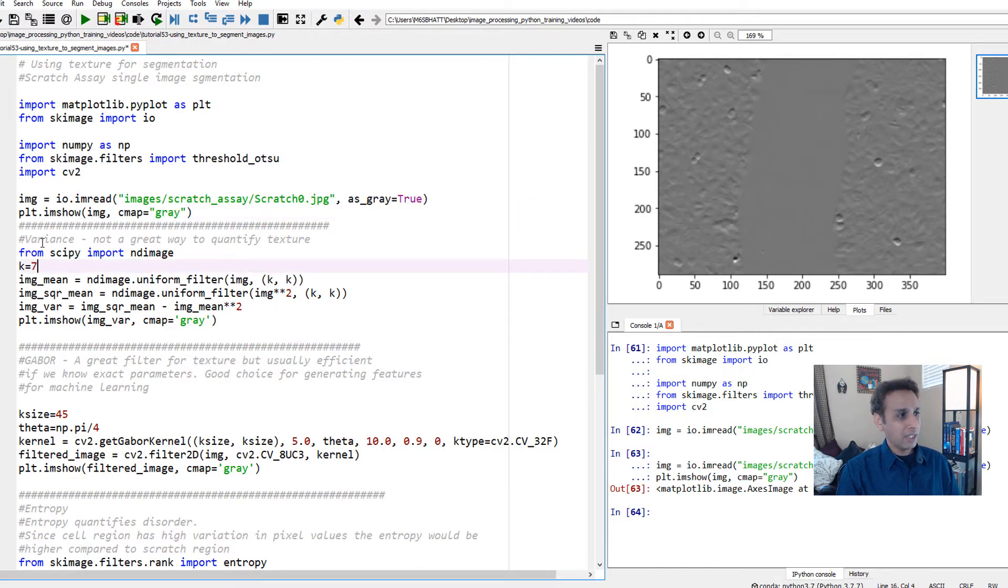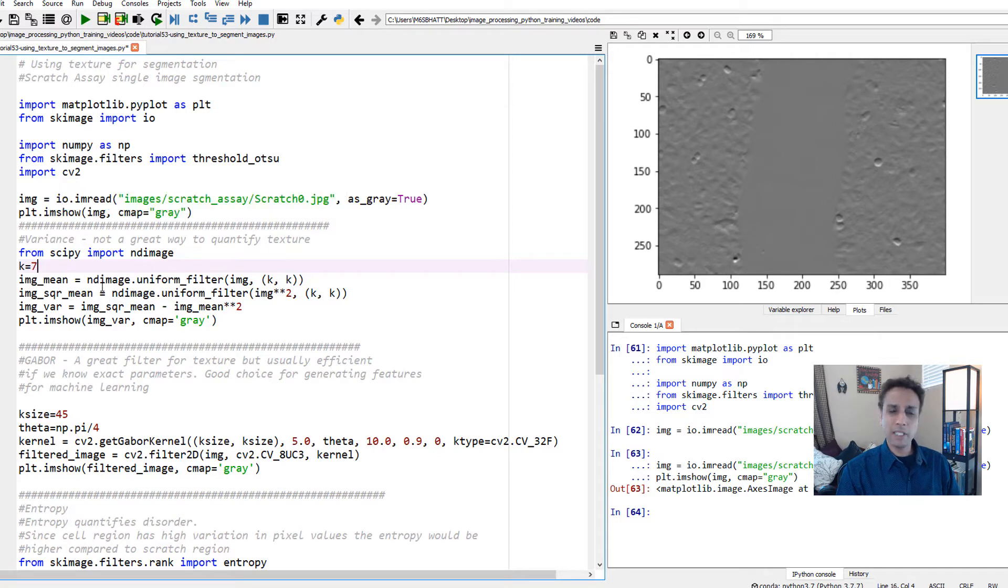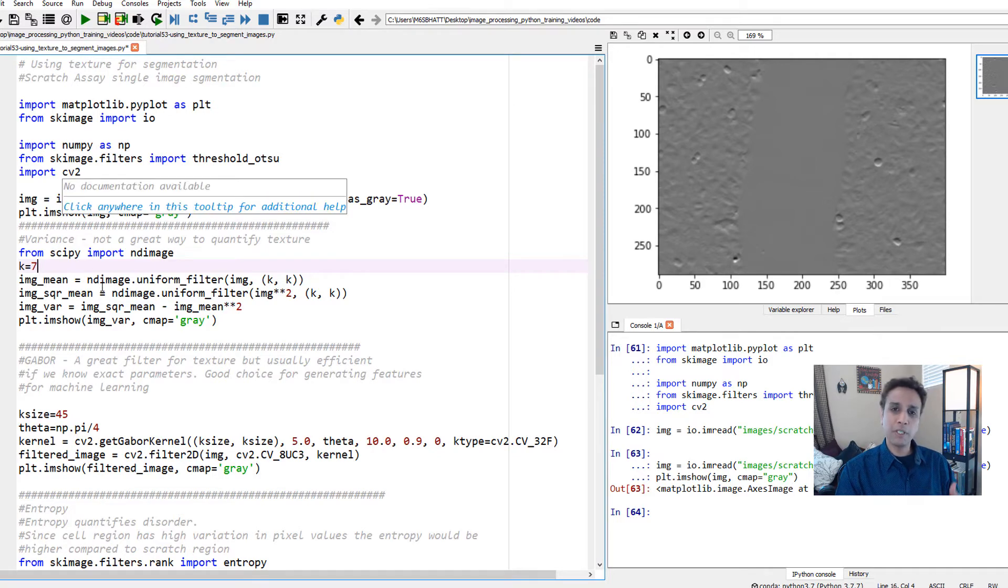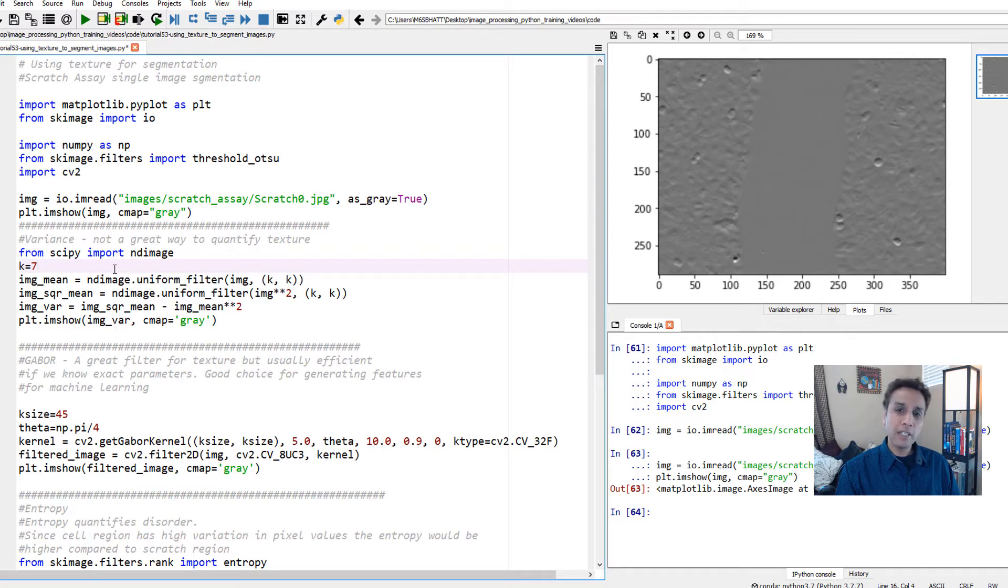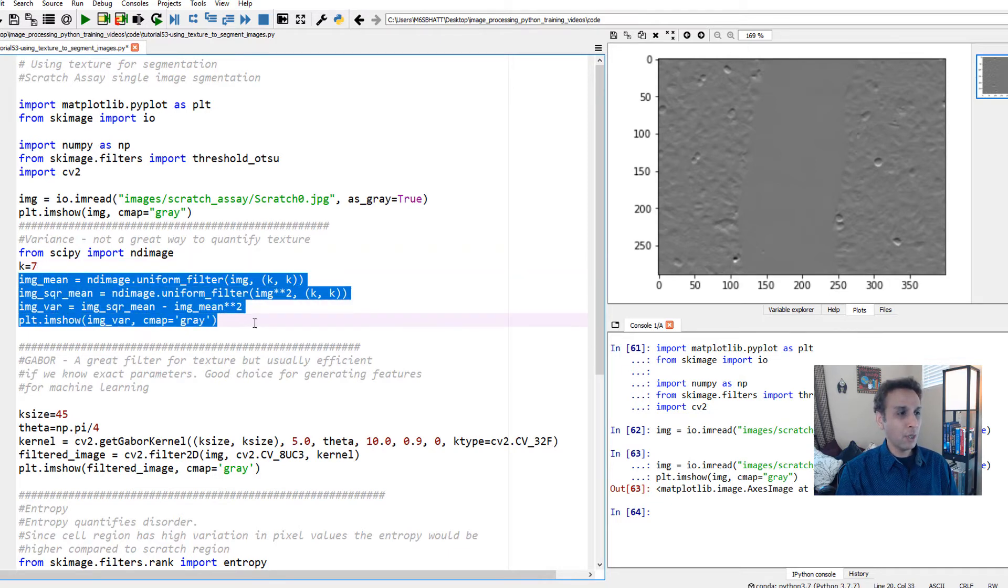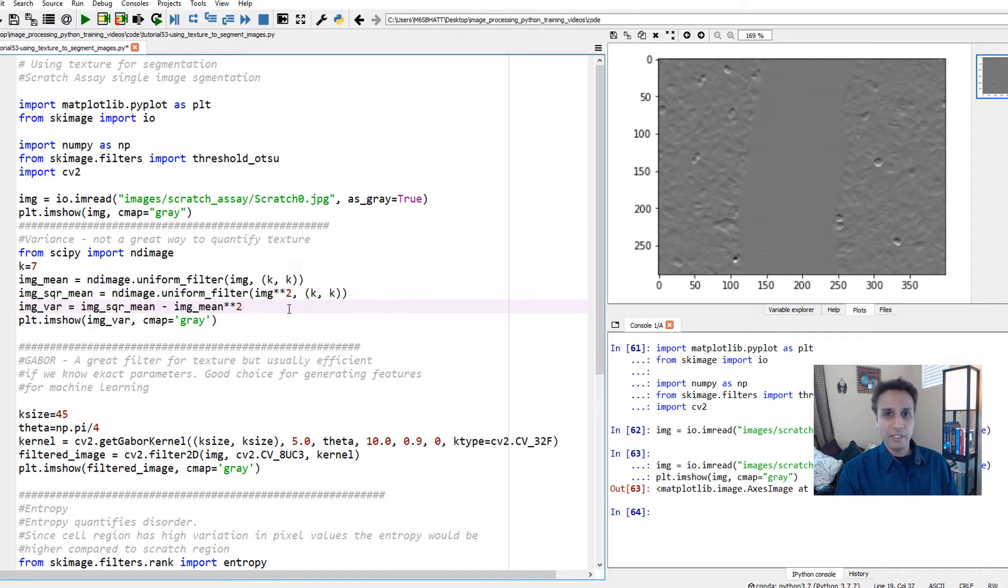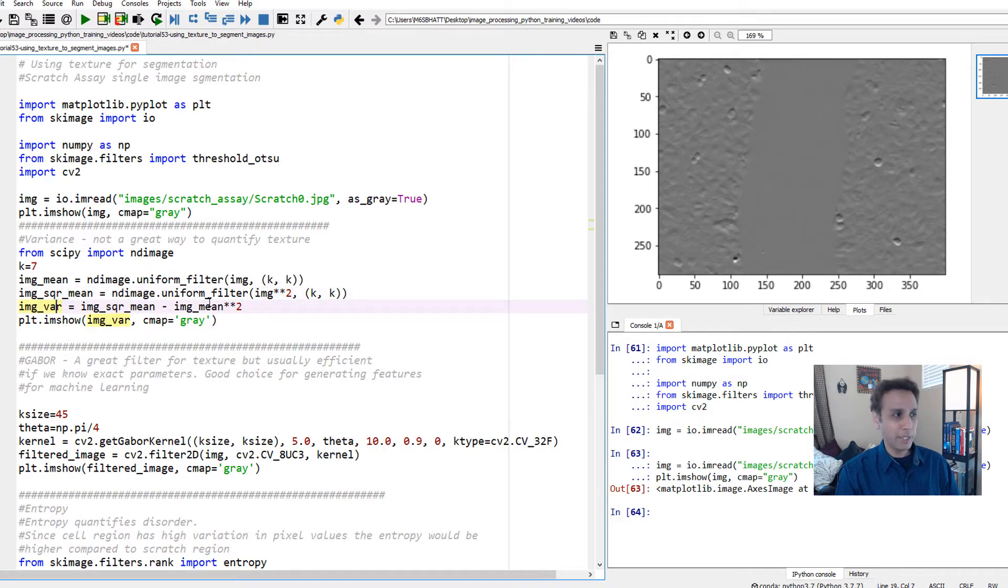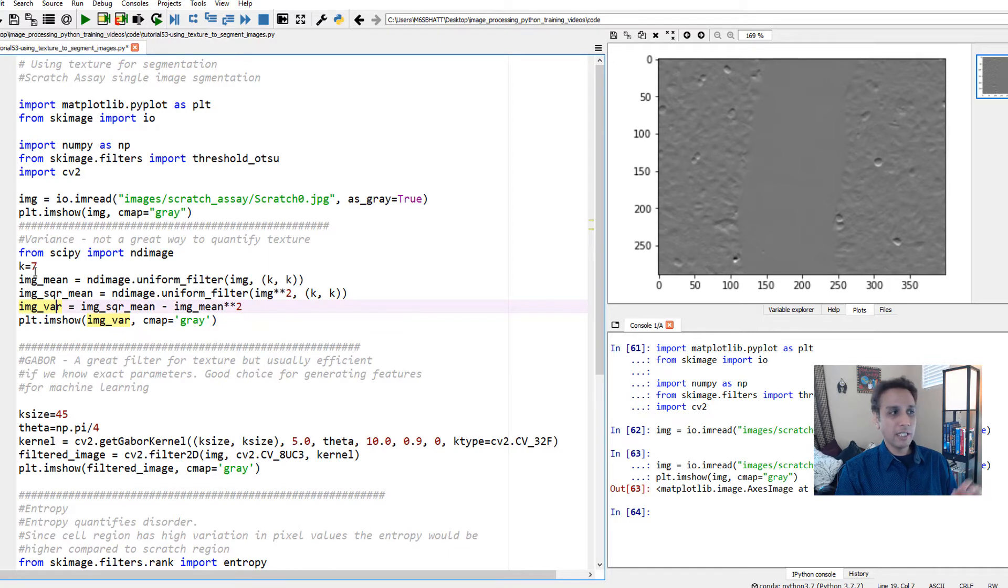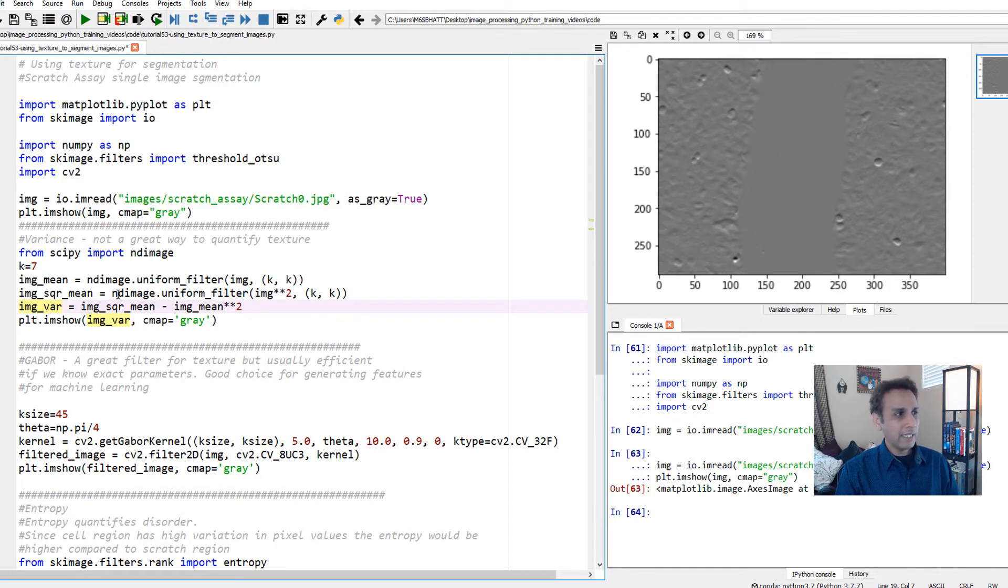We looked at variance. There is no standard variance filter, which was a surprise. I wrote three or four lines of code to calculate the variance using the formula. You calculate the mean and square of the mean, and variance is the square mean minus the image mean squared. I put a kernel size of seven to calculate this in patches.